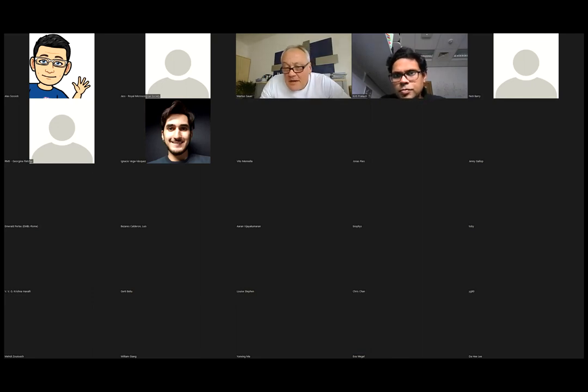Next question is from Anna Malkowska. I was just wondering, what are your thoughts on using STED instead of dSTORM? STED has been used in different papers. Helge Ewers, for example, published, I think, two nice papers on expansion STED, and also others.